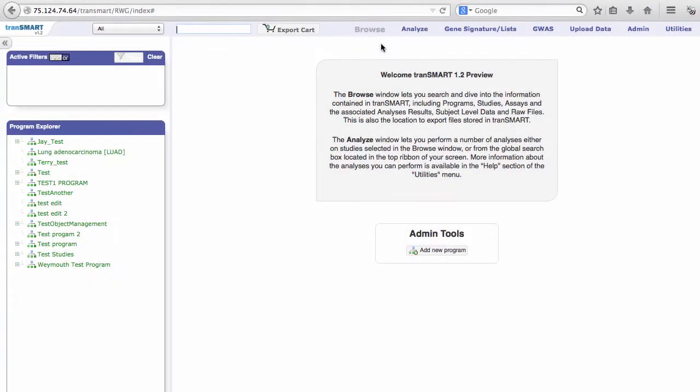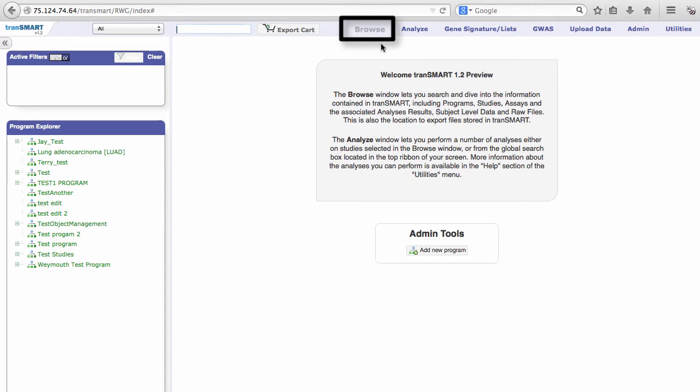One important interface change in version 1.2 is the new labels. The Search tool from version 1.1 is now called Browse. The Dataset Explorer tool is now Analyze.